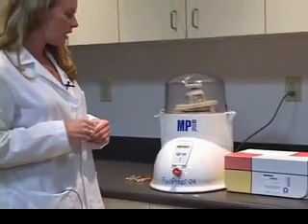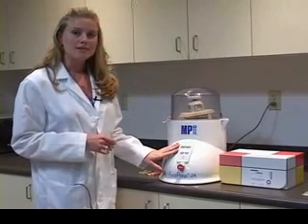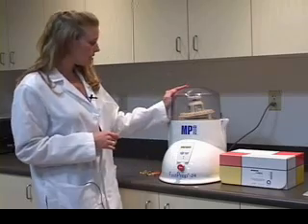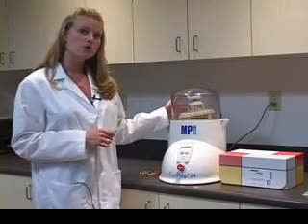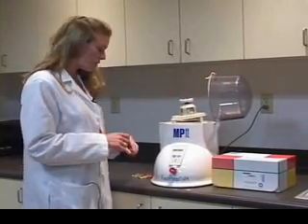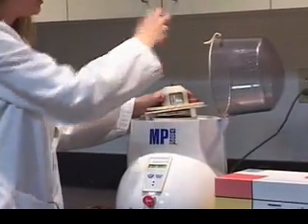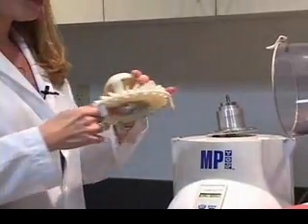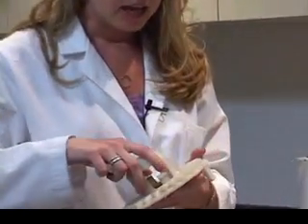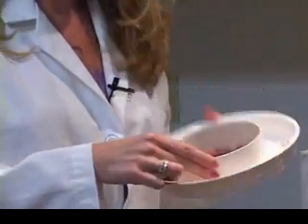The upgrades made to the machine include a complete redesign of the outside body, a brand new keypad that's much easier to use, and a clear top so that you can see the samples when they're being lysed. This instrument holds 24 samples and is held by one mechanism. The spoke plate is now removable — you can take one out, put it in the cold room, or keep one here. There's also a spill plate for easy clean up.